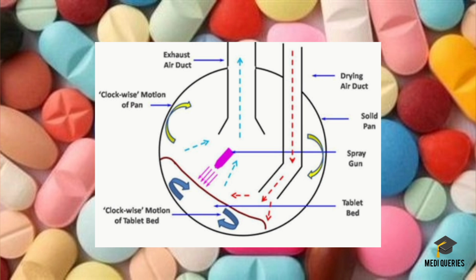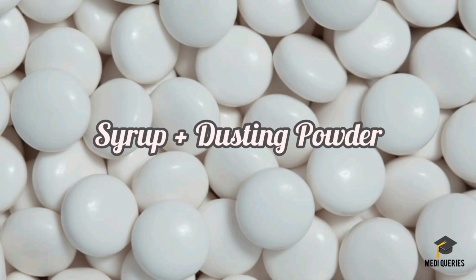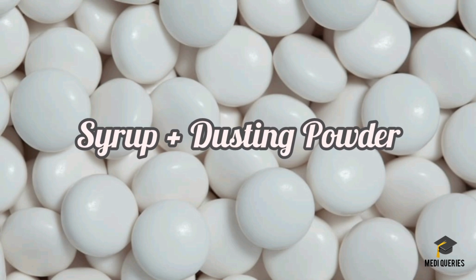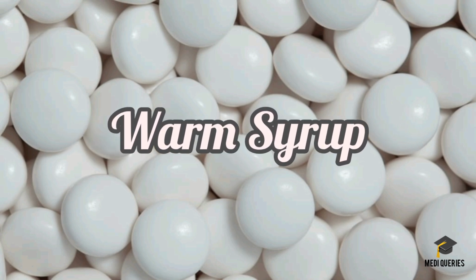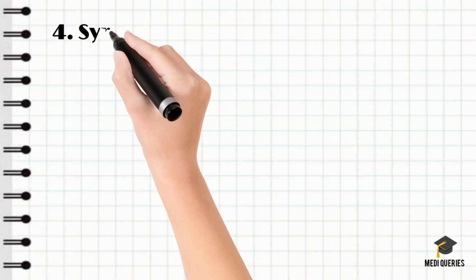Okay, so that's about the subcoating. In this method, we simply have to give alternate coats of the syrup and dusting powders. At the end of the process, we have to omit the dusting powder and simply give the warm syrupy coat. Okay, and the next step is the syrup coating.